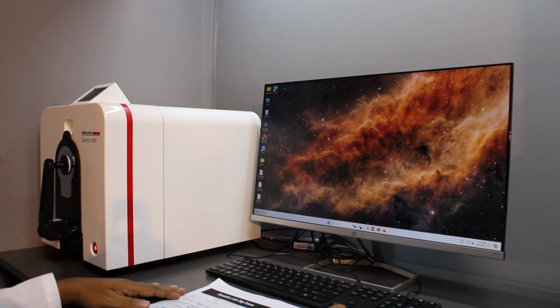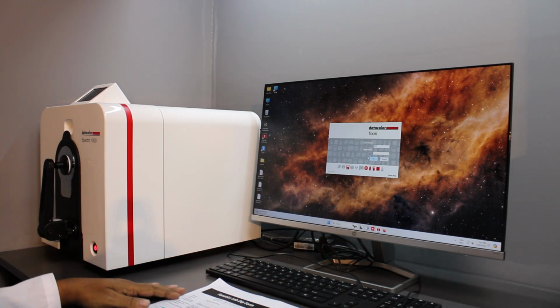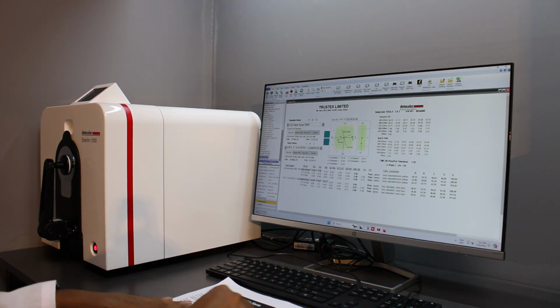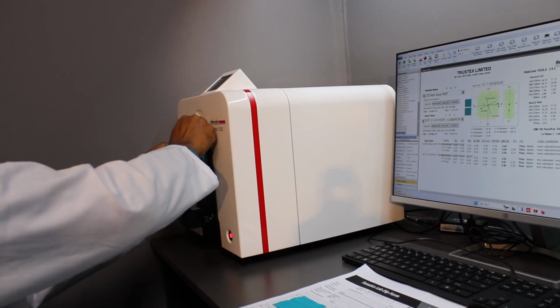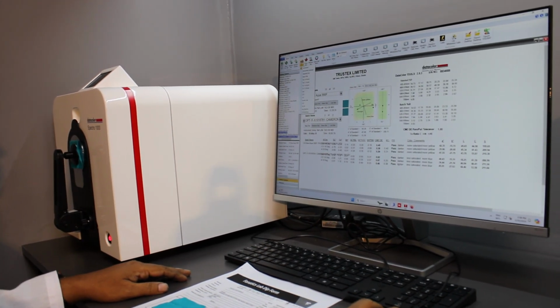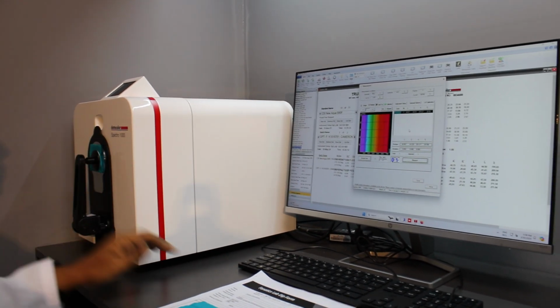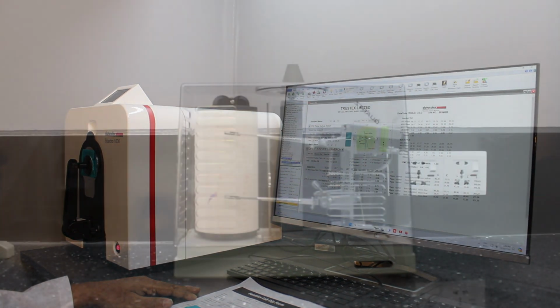In a textile laboratory, spectrophotometers are commonly used for measuring color and spectral data of fabrics and textiles. Here's a general procedure for using a spectrophotometer in such a setting. Each textile laboratory may have specific procedures tailored to their instruments and requirements, but this outline covers the basic steps involved in using a spectrophotometer for textile color measurement. Adjustments may be necessary based on the fabric type, desired measurements, and the capabilities of the spectrophotometer being used.